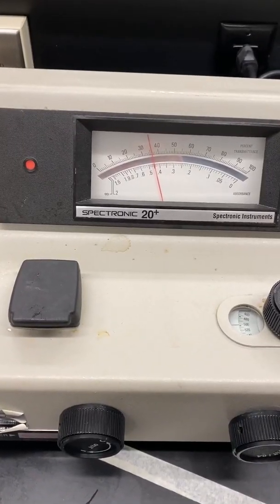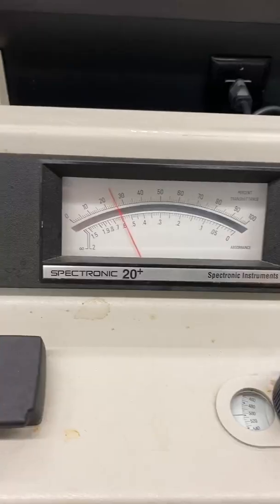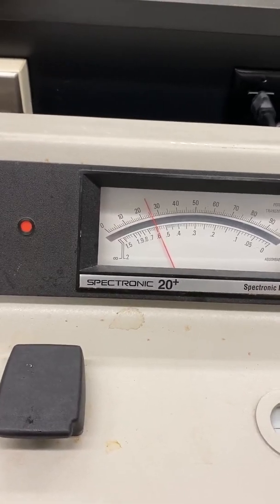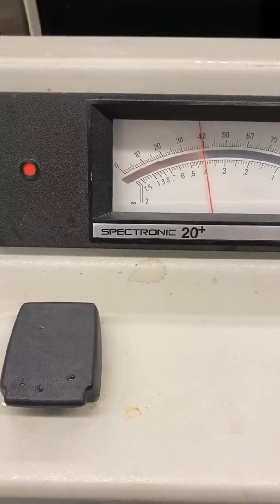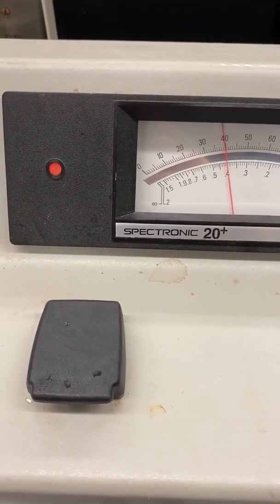Repeat the procedure with solution C and record the percent transmittance. Again, repeat the procedure with solution D and record the percent transmittance. Repeat with solution E, recording the percent transmittance. Finally, repeat the procedure with the unknown solution, recording the unknown's percent transmittance.